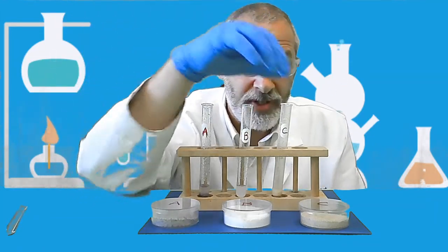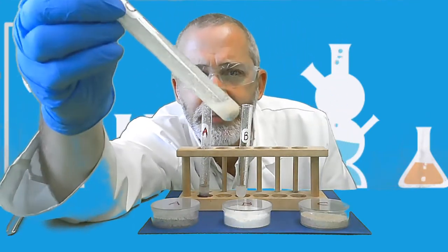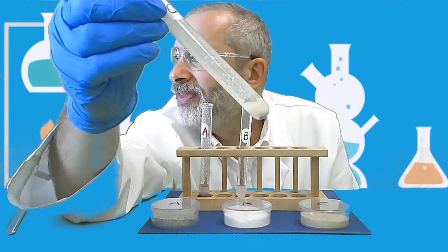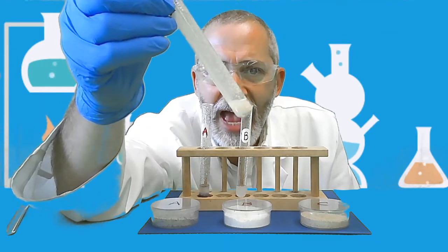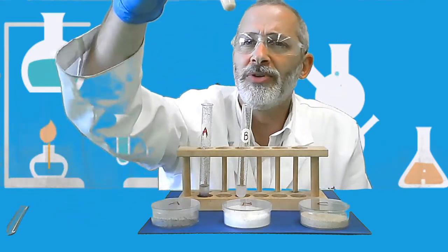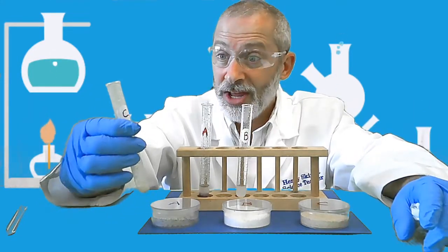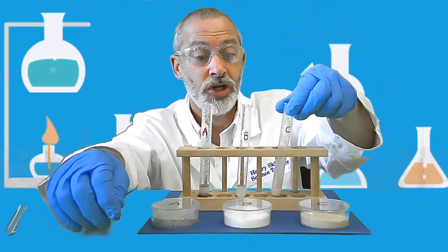And now test tube C. There was some settling of solids on the bottom. The water is very cloudy, and it's also a little bit foamy on the top because it's still making bubbles. There are bubbles actively being produced right now. There's some foam on the top with active bubbles. And, whoa. Okay, there is definitely an odor for test tube C. No doubt about it, as it continues to bubble.